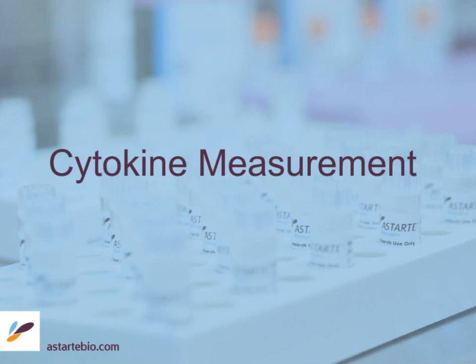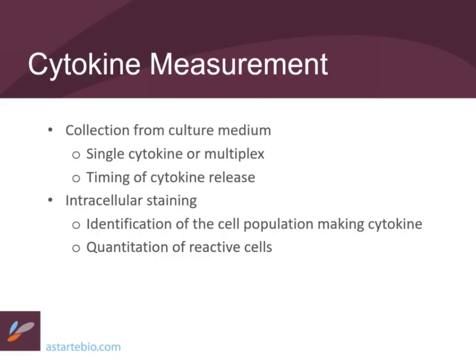Cytokine measurement is another very useful basket of methods because cytokines are produced in abundance following immune cell stimulation. You can either collect bulk medium from a culture after allowing time for stimulation to take place and measure either a single cytokine, or now with advances in technology, you can measure multiple cytokines in a relatively small volume of sample.